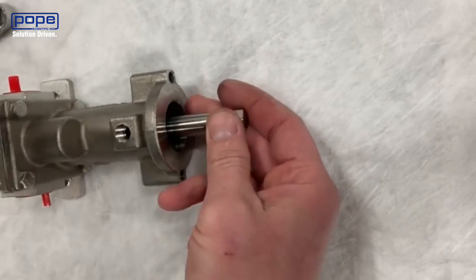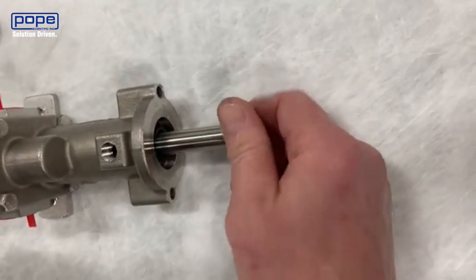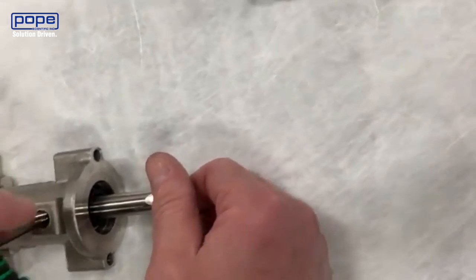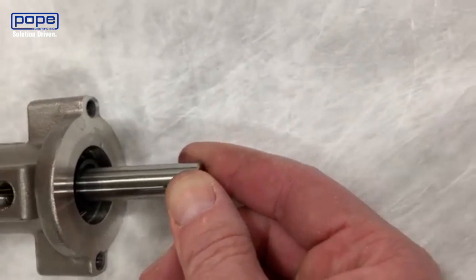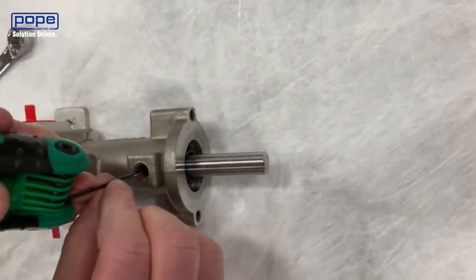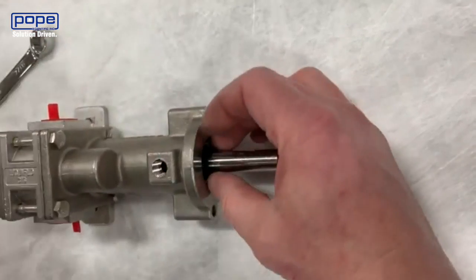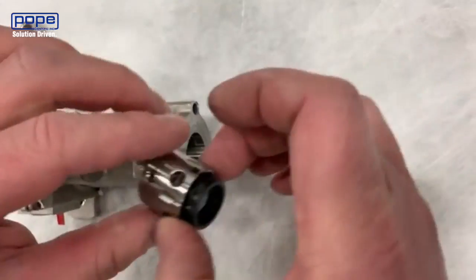The next thing we're going to do is look at the shaft of the pump and make sure that there are no burrs or scratches on there — anything that could damage the seal when it pulls off. You want to make sure that it's really smooth, with no markings that could scratch the seal, because there's a Teflon seal inside that's holding everything together. Now we're going to take a 2-millimeter Allen key and loosen the set screws on either side, and then we can pull off that mechanical seal.